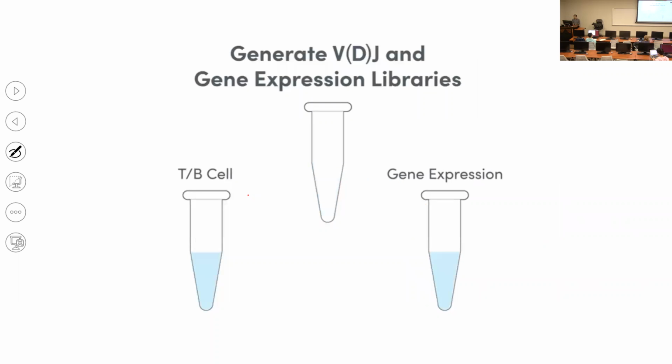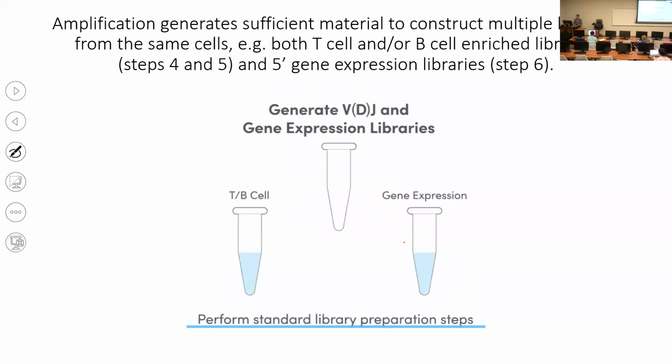Okay, so this cartoon is the most important part. So I split the amplified solution into half here, half here, and process them downstream separately, independently.